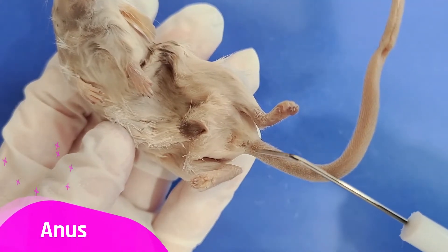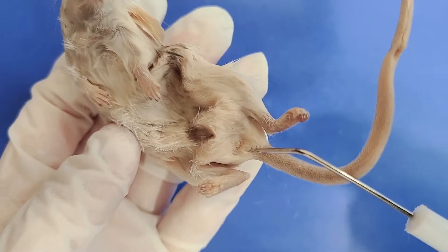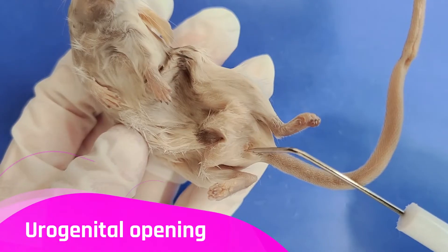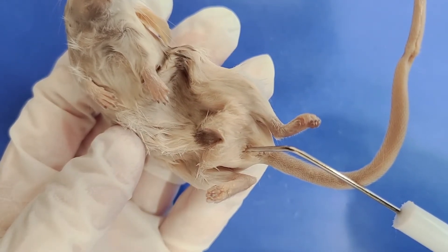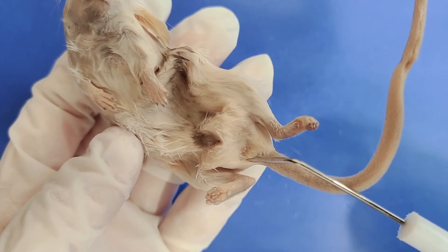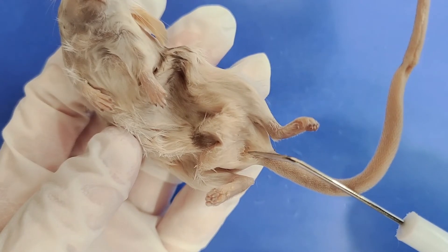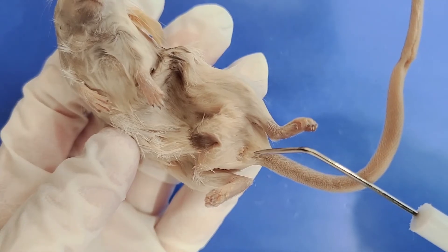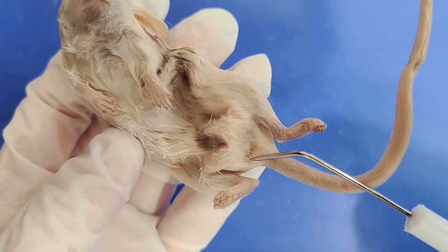Here's the anus, near the base of the tail, which is the exit for the digestive tract. More anterior to that is the urogenital opening, which is the opening for the urinary and reproductive systems. You can determine the sex of a mouse by examining the distance between the urogenital opening and the anus. In males, the two openings will be further apart, but since it's pretty close here, we can tell that this is a female mouse.